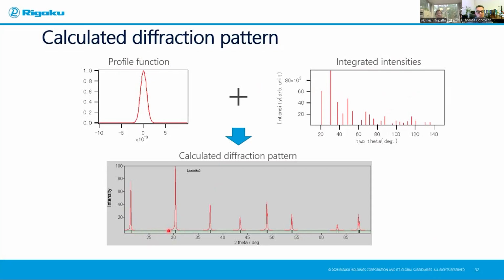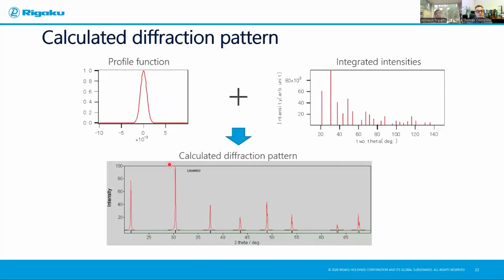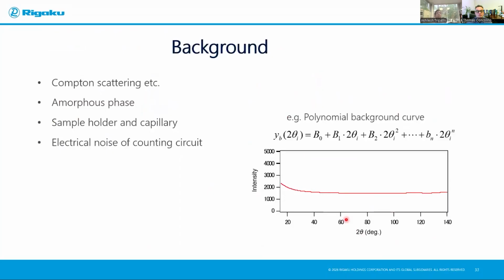But they're still not connected. The software has some idea from the phase. You have peaks at some distinct Bragg angles where the X-ray diffraction conditions get satisfied in your pattern. So then you need to add these peaks onto the points. The software uses a background function, usually a number of background functions. Again, you have a choice there.